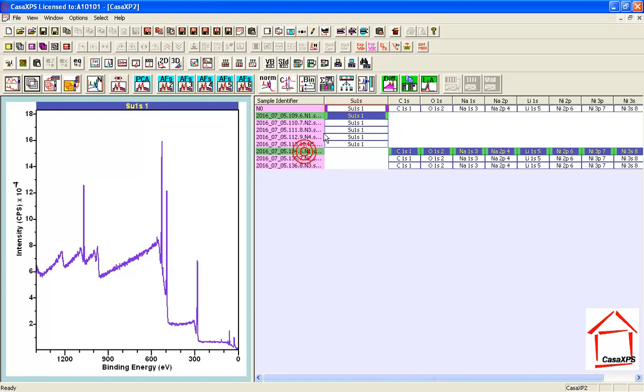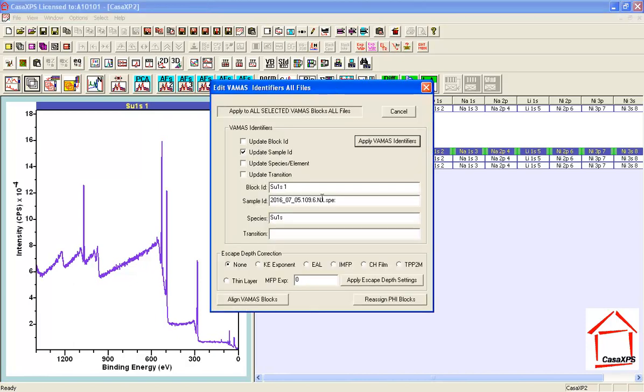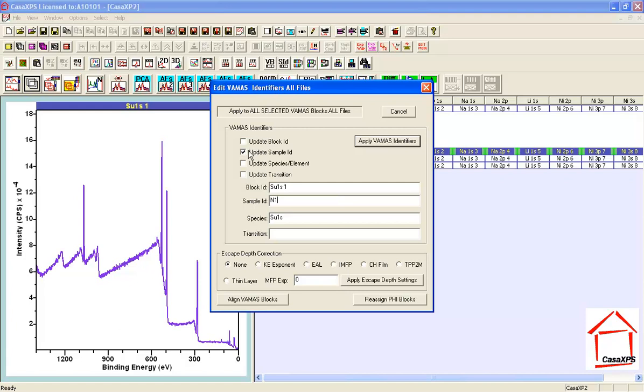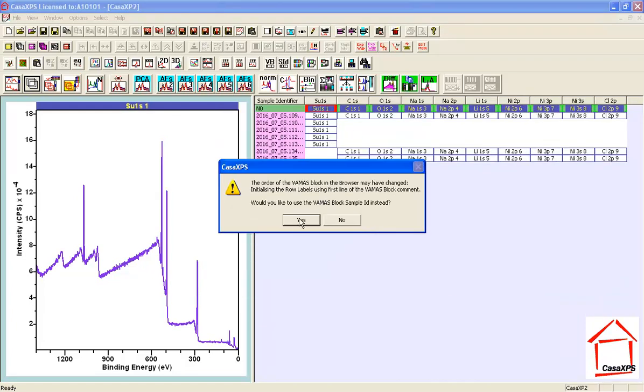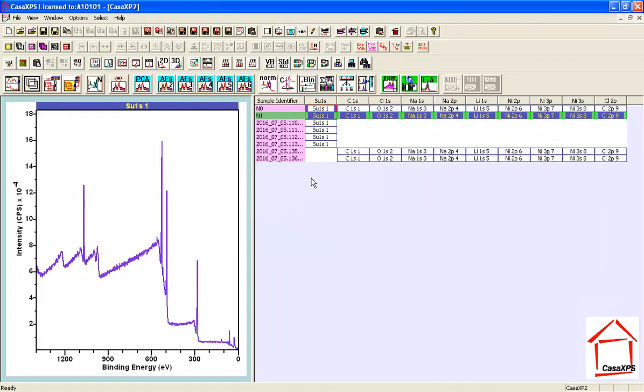...you notice that the tick boxes remain unticked once they've been used. So it remembers the fact that I'm only interested in the sample ID and we can go through and make another adjustment.